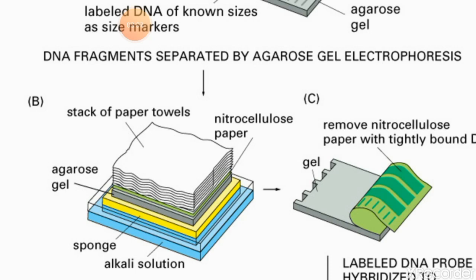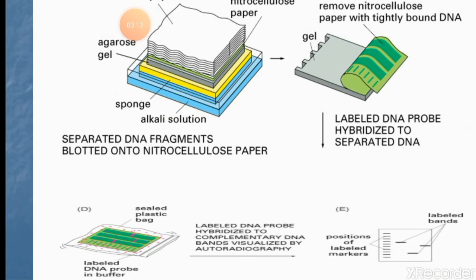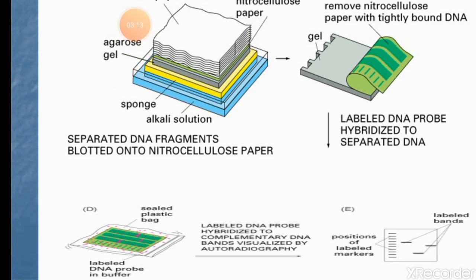Then we remove the nitrocellulose paper, and it is incubated with the DNA probes. The DNA probes have complementary strands, so they get hybridized. After a certain period of hybridization, the excess is washed away, and then we read the amount of hybridization to find out the target DNAs.